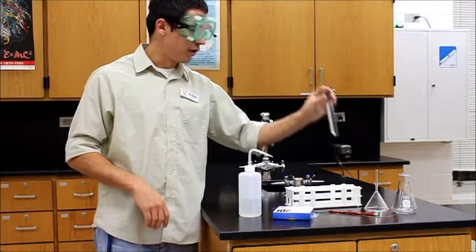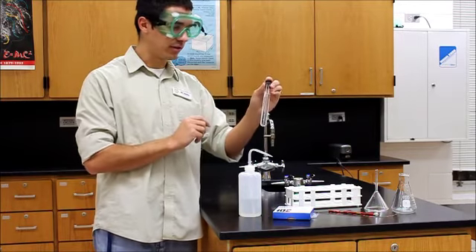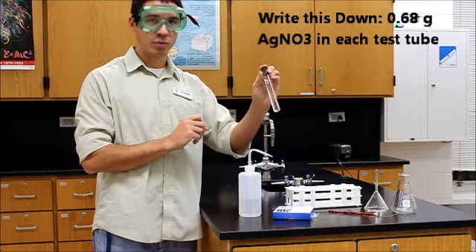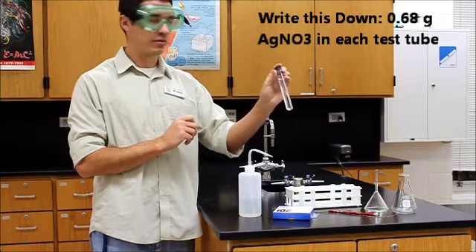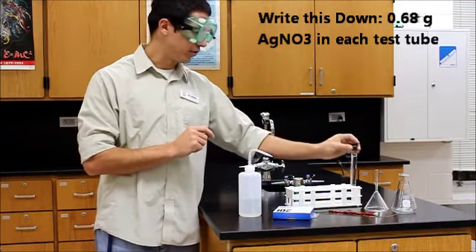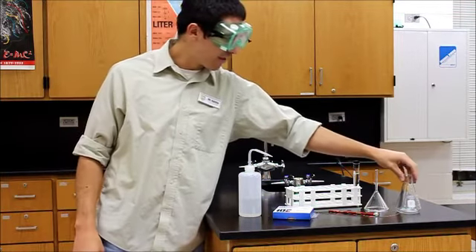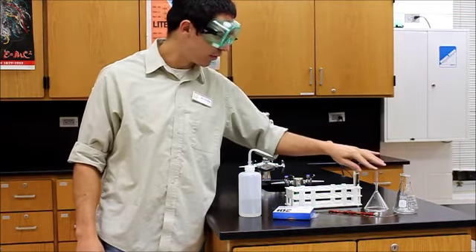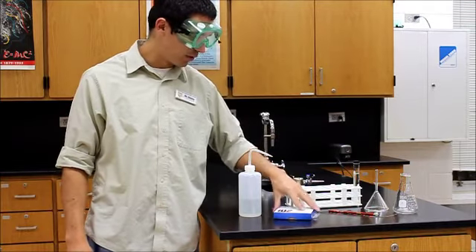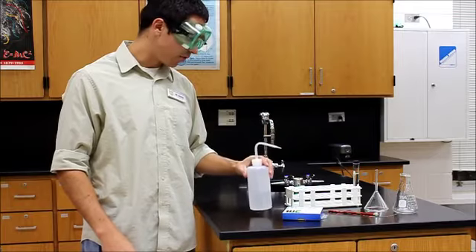We're also going to have our test tube of silver nitrate. So we've pre-weighed this. This test tube contains 0.68 grams of silver nitrate. So you should write that down in your notebooks, 0.68 grams of silver nitrate. We have a flask and a funnel. Those are going to be used for filtering. We're also going to use some filter paper for the filtering, and we're going to need a squirt bottle.